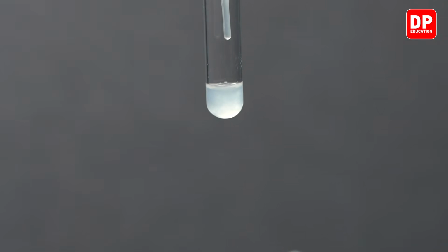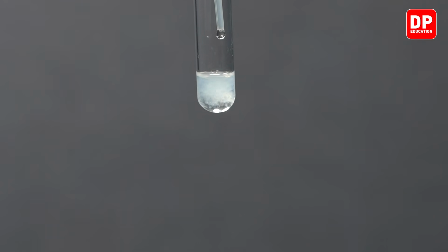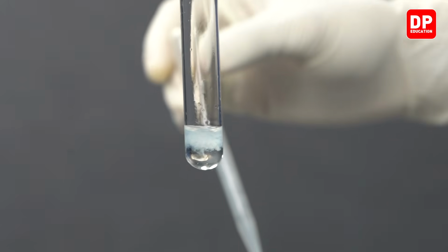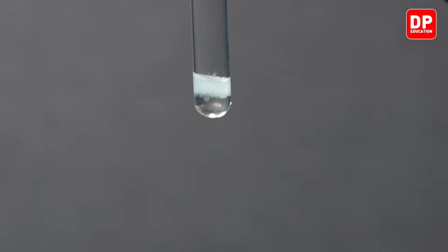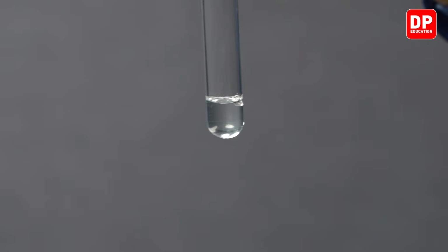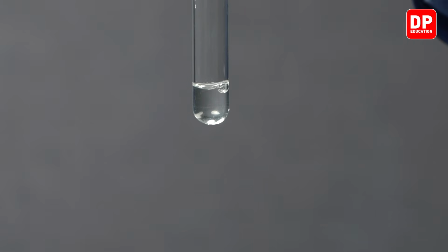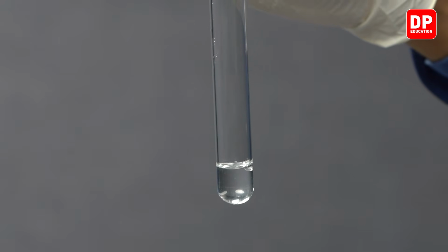You can see as a few drops of concentrated sodium hydroxide is added, the aluminium hydroxide precipitate that we observed started to dissolve in it. So let's shake this and observe what happens. As you can see, when we shake the solution, the sodium hydroxide further reacted with aluminium hydroxide and dissolved the aluminium hydroxide in excess sodium hydroxide.